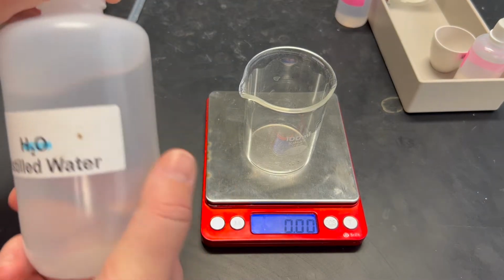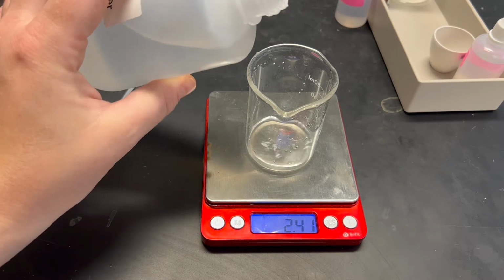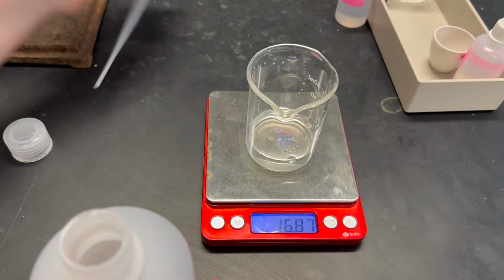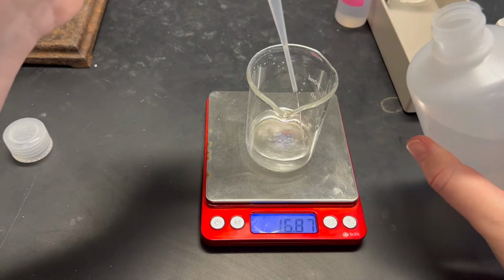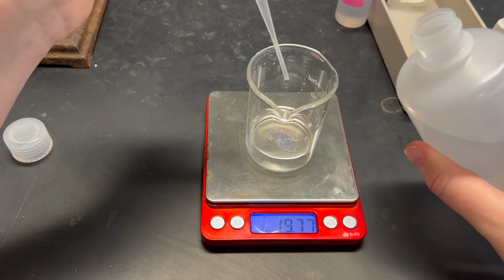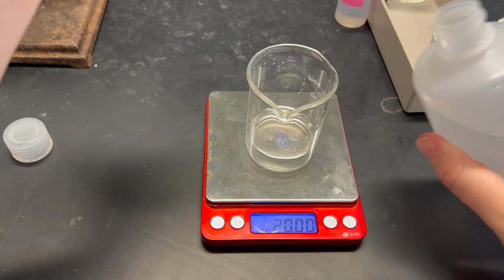Then, using your distilled water and a pipette, you can pour very slowly in the beginning, just a little bit at a time so you don't go over 20. 16. Here I'm going to stop, and now I'm going to use my pipette to pipette the rest of the water in to get me up to 20. I'm going to go drop by drop at the end here. I'm looking for something exact. There we go, exactly 20.